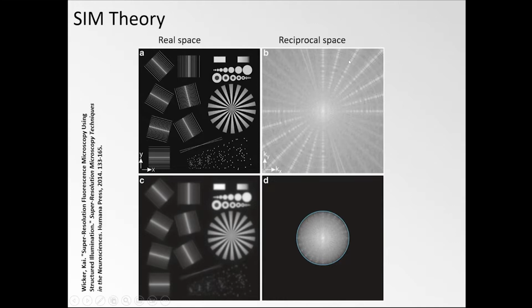You may not be able to ever see it as such, but this would be the true Fourier transform. And you can see, probably owing to the Siemens star, there are these spokes that radiate out from the origin. So the further you're away from the origin, the higher the frequencies are, and the direction also encodes in real space in which direction these fine features are.